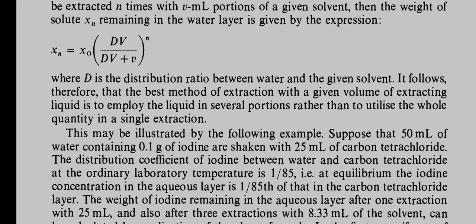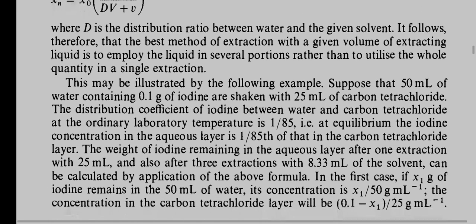It follows therefore that the best method of extraction with the given volume of extracting liquid is to employ the liquid in several portions rather than to utilize the whole quantity in a single extraction. This may be illustrated by the following example.